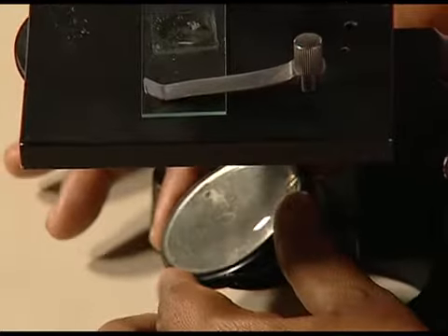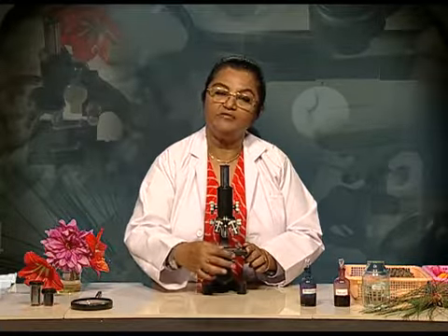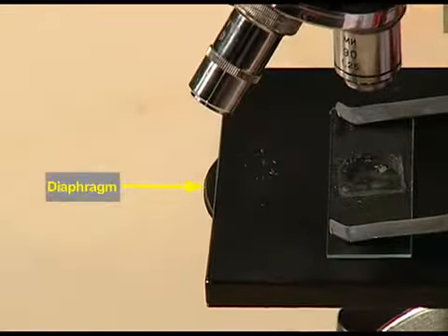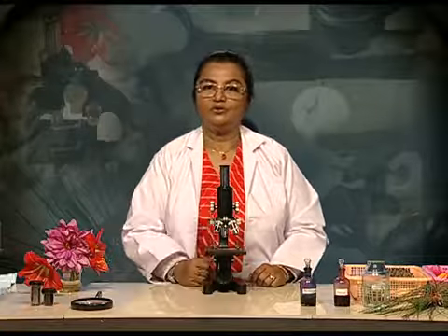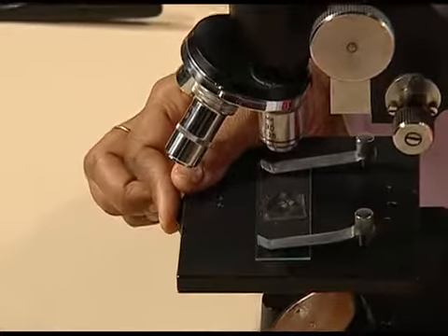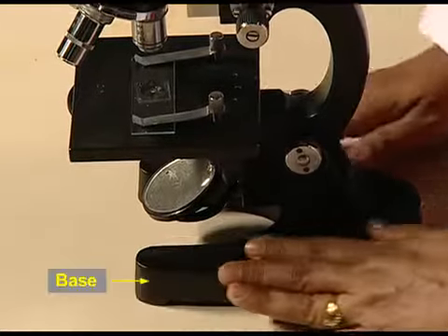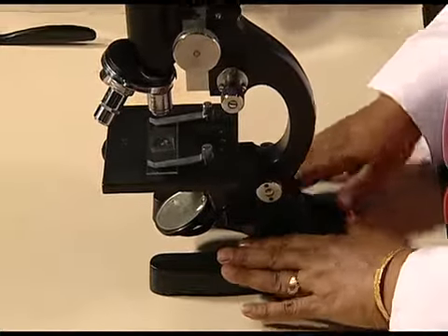After we have reflected the light, we will adjust it with the help of a dial, which is known as the diaphragm. This diaphragm has holes of different sizes, and depending on how much light we want, we can shift the dial to the required hole. Then there is the base of the microscope, which is horseshoe shaped and keeps the microscope stable.